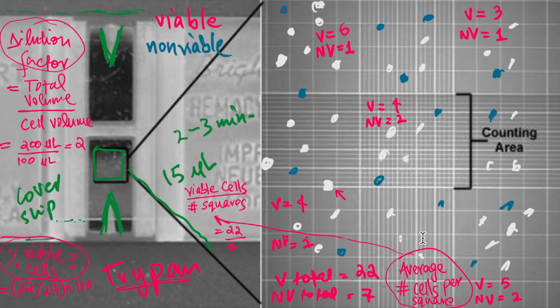And finally, perhaps the most important parameter that we're interested in is concentration. What is the concentration of the cells in our study? That is one key parameter that we're interested in, and it's a combination of a few things. Let me write it down here.